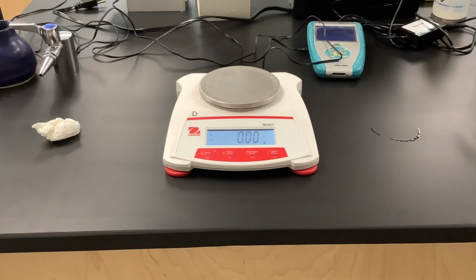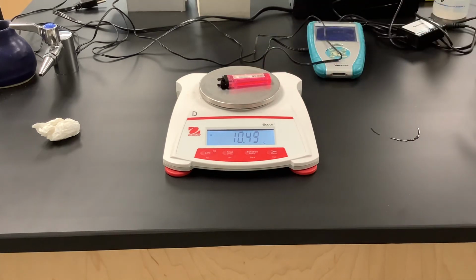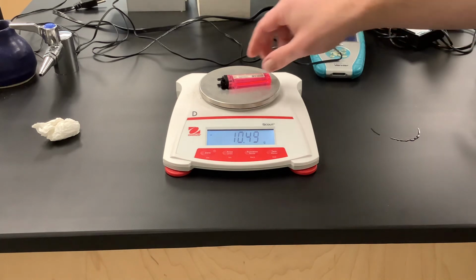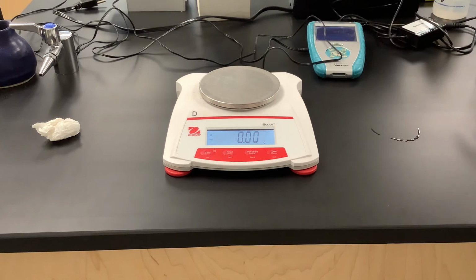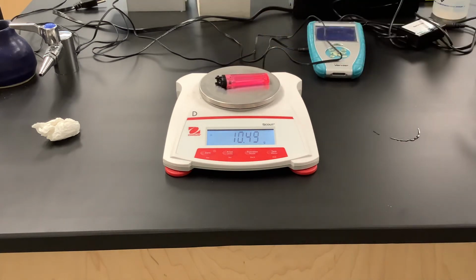Now we're not going to write this first one down right away. What we're going to do is we're going to weigh it and we're going to see what it is, and then we're going to shake it a little bit more and see if that changes. So we're at 10.49. But I'm not sure if I got all the water off of it. So what I'm going to do is I'm just going to take it off. I'm going to dry it a little bit more. I'm going to shake it a little bit more, and then I'm going to put it back on the scale. And if it stays the same, then we know we pretty much got all the water out of it. Looks like we're good at 10.49.